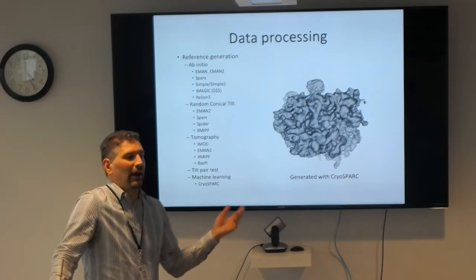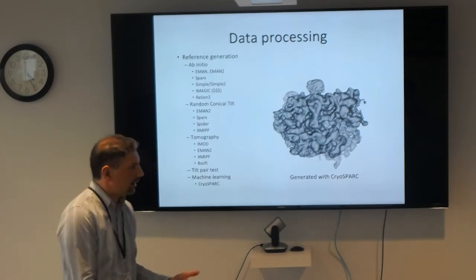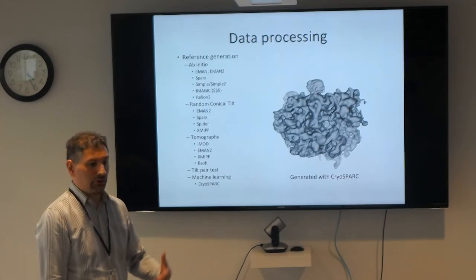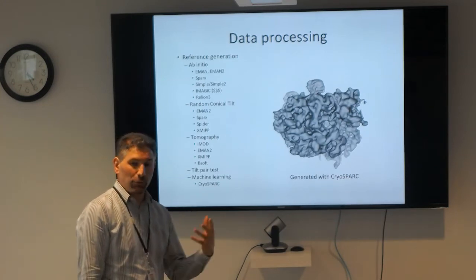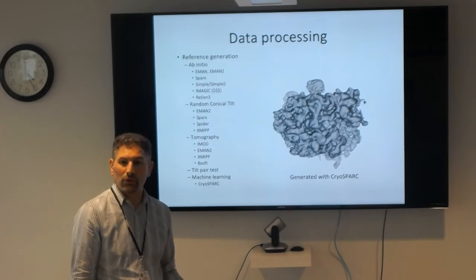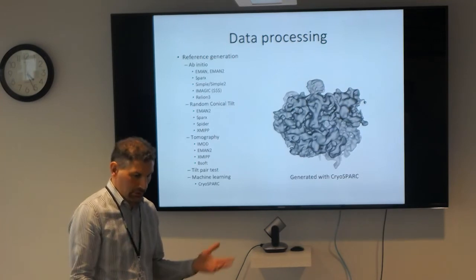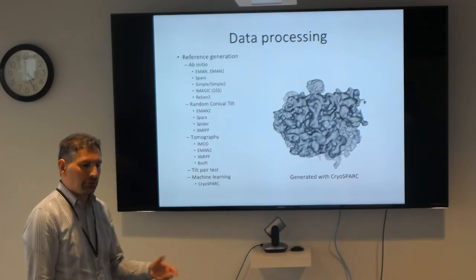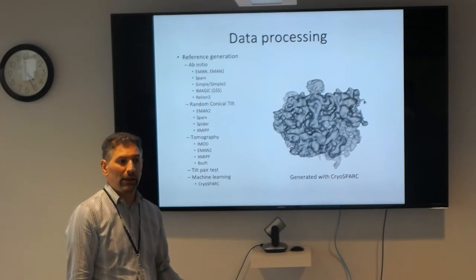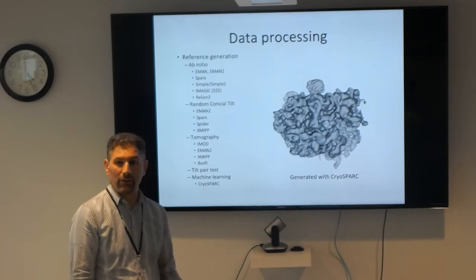And if you're like, I don't care how it does it, I just want to get my Cell paper, you see a lot of Cell papers like that, and that's fine. That's the purpose of automating a procedure. When you make a program that's robust enough, and the technique is robust enough, the user doesn't necessarily need to know what's going on, and they can do their science. We see this with many different techniques inside the lab, and that's really the hallmark that a technique has matured and reached a point where anybody who has access to a microscope and has a sample can do it.